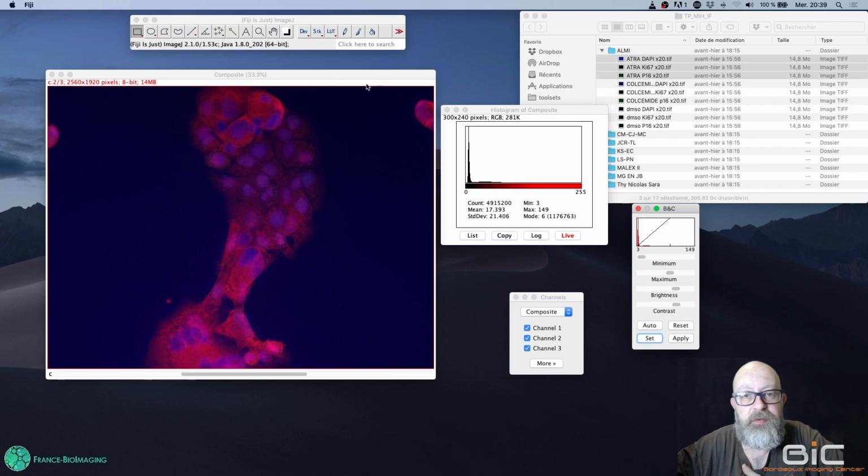Now, the thing we could do is do exactly the same for the other channels. Here, I will move to the green channel that I can't see on the screen right now. This is because the signal is encompassed in a range of 0 to 27, meaning that you've got only 1/10 of the full range that is used, so all the values will have really dark shades.